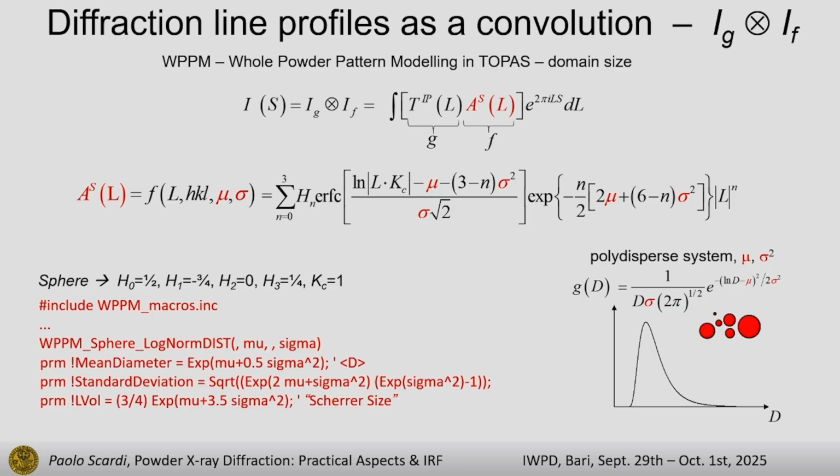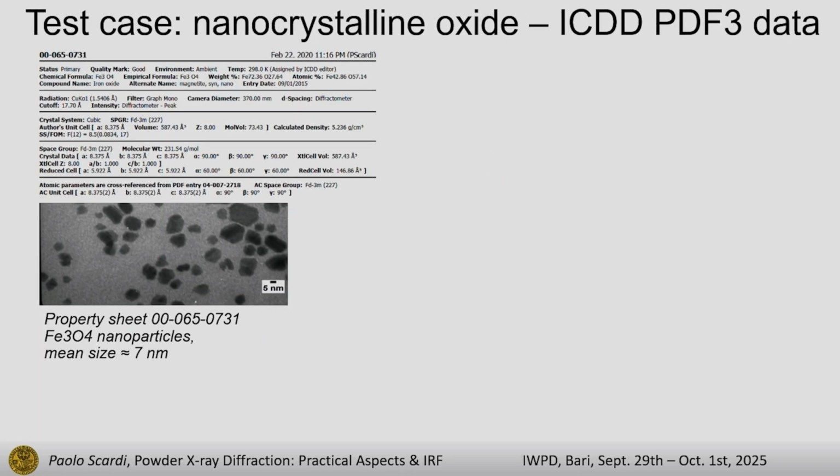And these are the simple formulas. Again, you can use Topas to say, please calculate this for me. And these are the simple expressions you can use. Okay, let's see this in action on this sample.